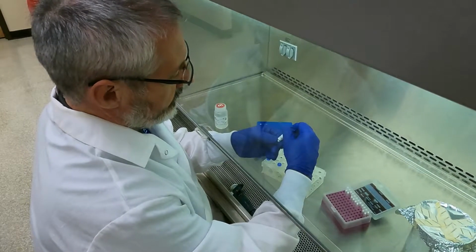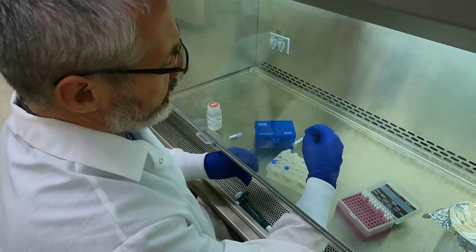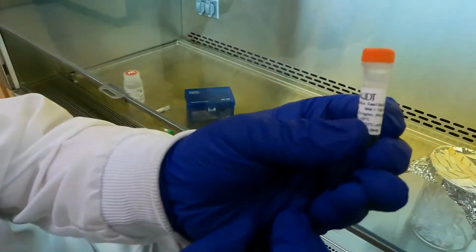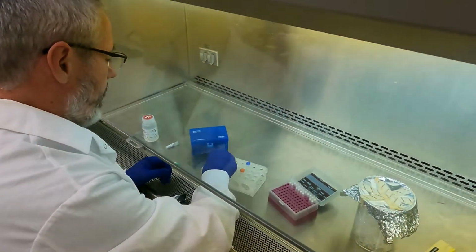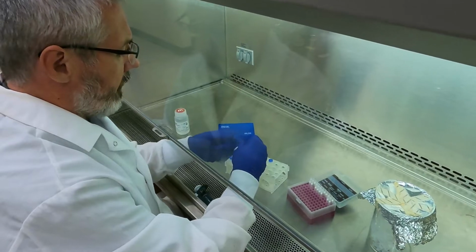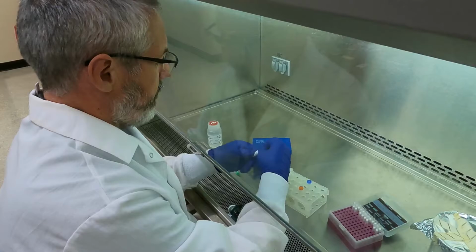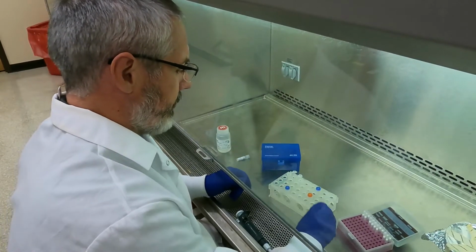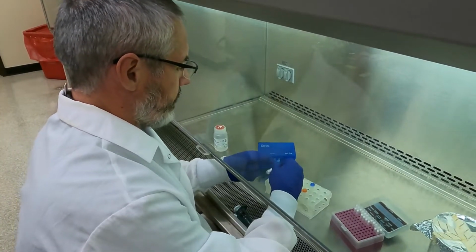And here we have our Cas12a, and it's CPF1 Ultra. So it's a specially genetically modified Cas12a, which has got 2 nuclear localization sites on it. And so the idea is to actually make a complex between the RNA and the nuclease in these tubes here, and then apply them to the cells. So we'll do this, hopefully that's gone into solution. Flip around.